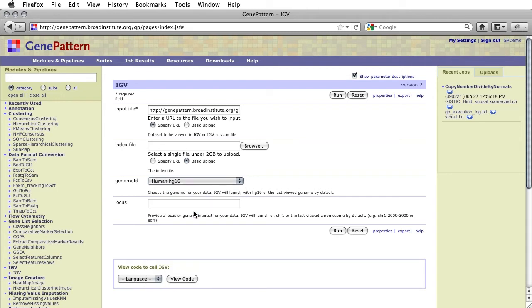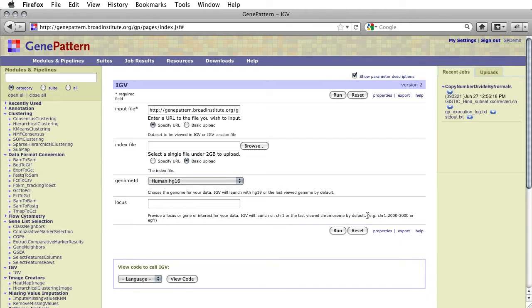We may also specify the locus of interest, if we know ahead of time where we are interested in looking. We could do this by specifying a gene of interest, such as EGFR, or a locus in the format indicated by the caption below. For this tutorial, we will leave this field blank.